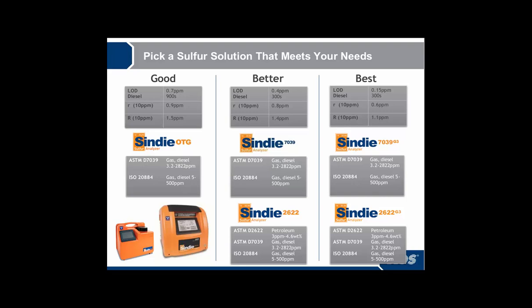What is the difference between using Mylar or Proline on an OTG or other 7039 secondary windows? And the difference here is basically on the film itself and its transmissivity. You'll notice that the OTG is our good solution. You'll notice that the limit of detection is not as good as a Gen 2 or a Gen 3.